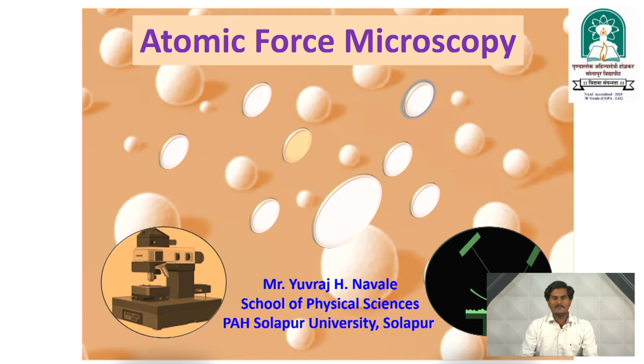For example, by using XRD, we get the crystal structural information of the material, like defects and crystallite size of the sample material. By using scanning electron microscopy, we can get the morphological analysis of the sample material.